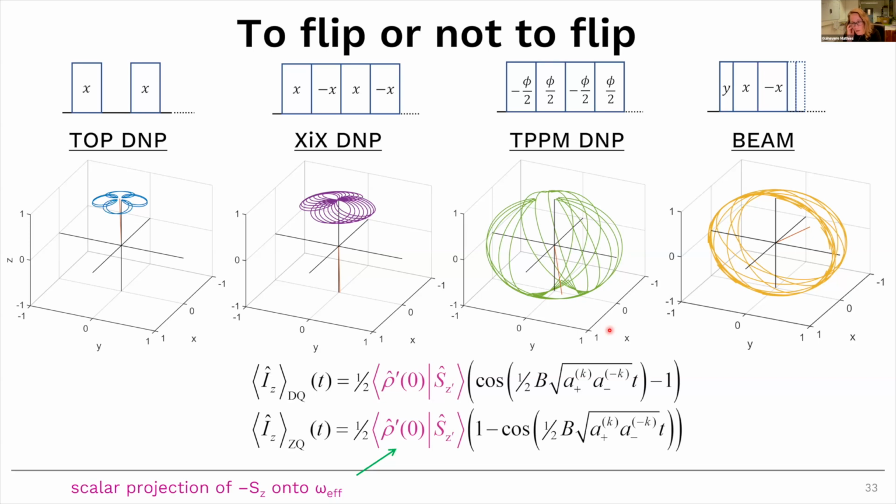Now, what we've tried to solve this problem for novel is that instead of just applying the 90-degree phase change alone, we apply a flip-back pulse at the end of the novel sequence, so that we help the spins get back to the Z-axis already. That got us higher enhancements, and it also allowed us to work at a faster repetition time.